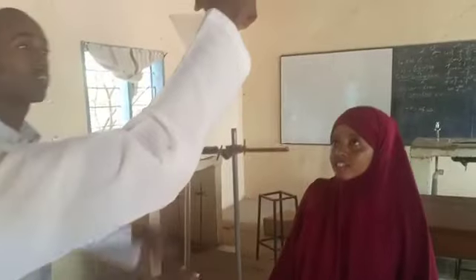So this is solution E, which is hydrochloric acid. So we fill it in the burette.